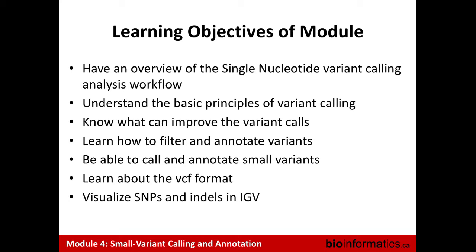I hope you will understand the basic principle of variant calling. Why do I say the basic principle? Because each variant caller uses different methods, different algorithms, different probability formulas. So I cannot give you so much detail on that, but you need to understand how it works, to understand how we can have the best variant calling. We already talked about that yesterday, when we tried to improve the BAM, how this has an impact on the variant calling.